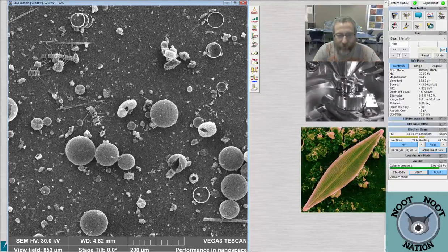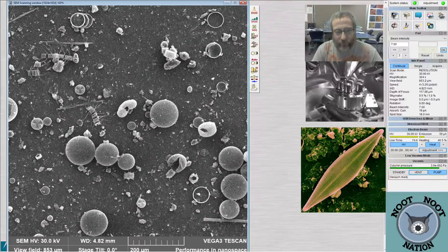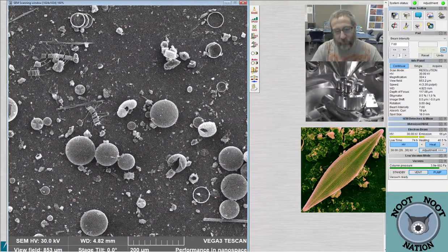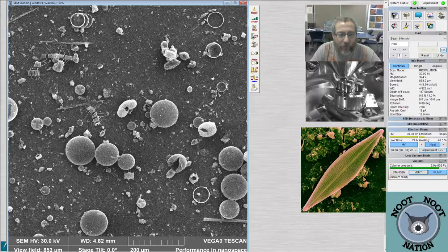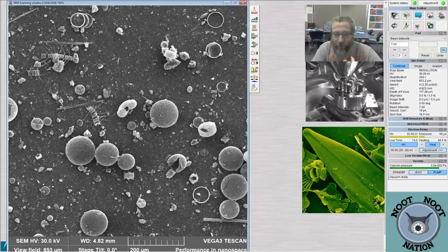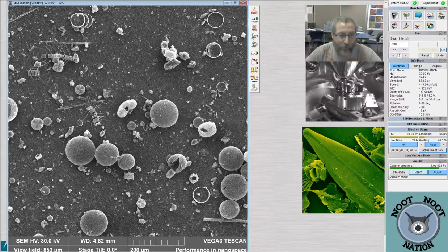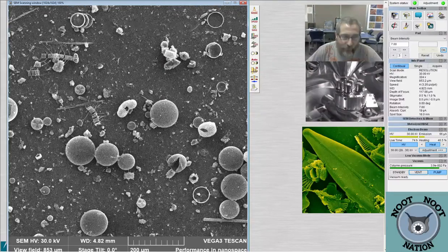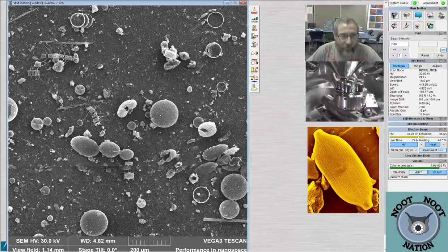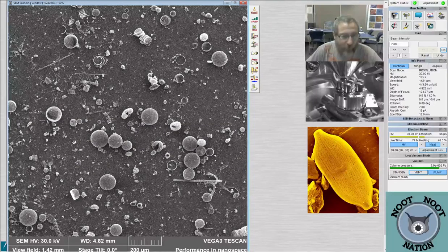Then it puts a division between those, and it builds a cell wall around the nucleus on the inside of the valve. It does this by adding some girdle bands so that it can be a little bit wider in the middle. And then it basically makes a whole cell, back to back inside the valve. And then these two things pop apart, and you have two diatoms where you used to have one. And that's how most of the reproduction happens.